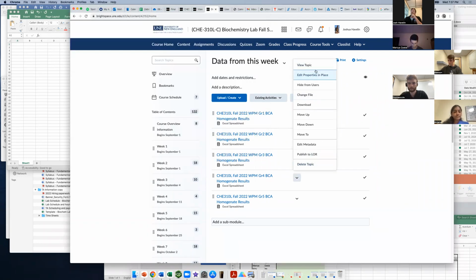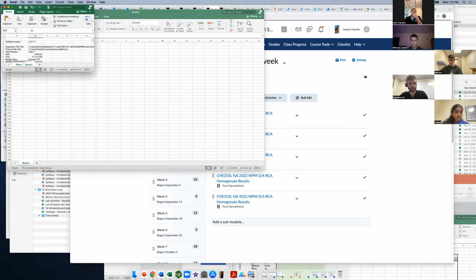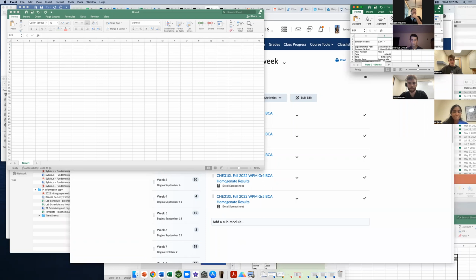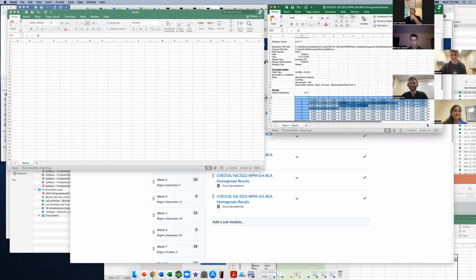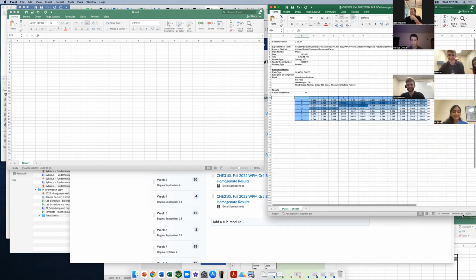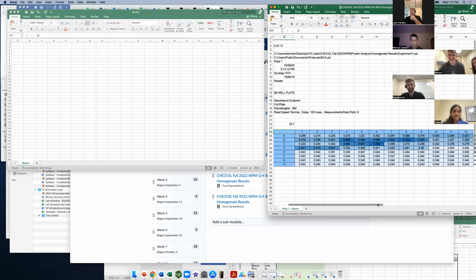Okay, so I'm going to use my favorite group's data as an example. Dawson, you asked me to use this in lab. Rough, professor. Favorite's sarcastic. Dawson just specifically asked. Okay. I called dibs. You called dibs.